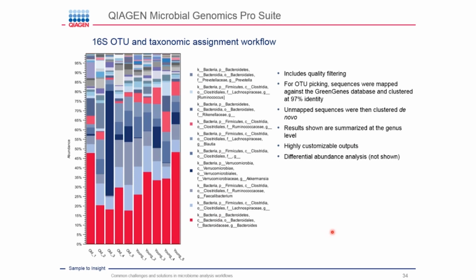And also reads which were not mapped directly were then clustered and de novo analyzed. So here already, on the left side the old and on the right side the young individual samples, it seems to me that we have a higher variation or a higher diversity in our young individuals, as you can see here. Many more different bars compared to the older individuals.